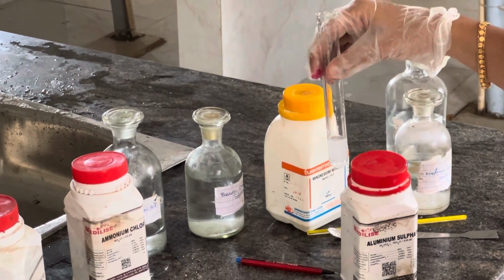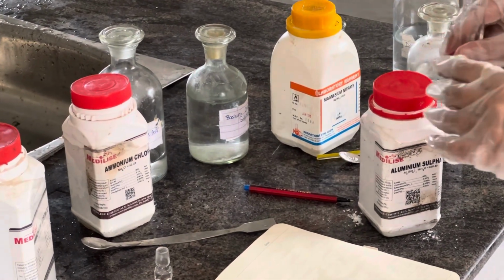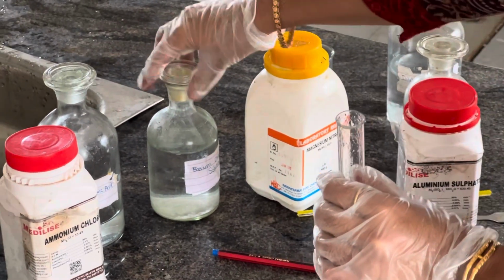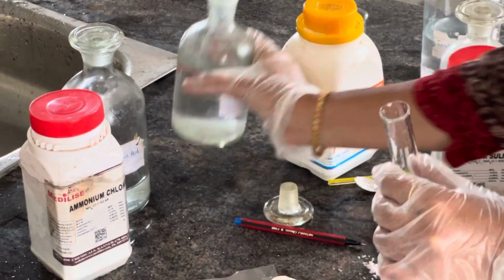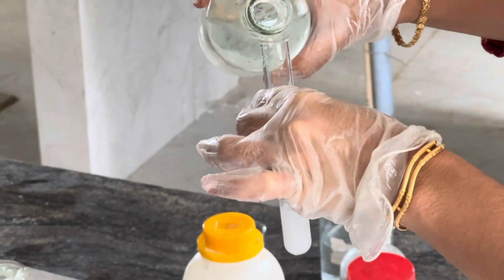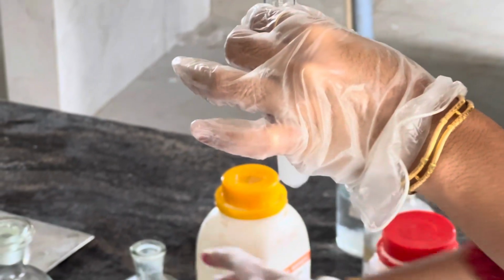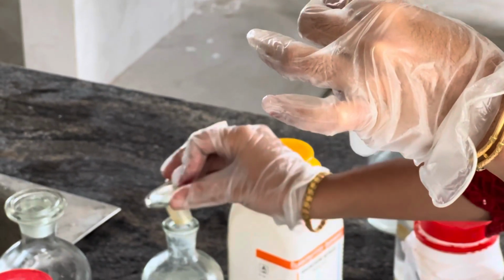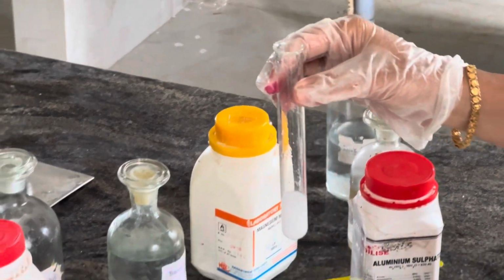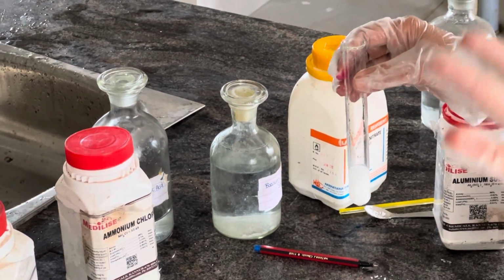So here I have the salt solution. In order to test for the presence of sulphate, I have taken the salt solution, that is, salt with a little water added to make the salt solution, which is known as the original solution. To test for sulphate, I am adding barium chloride. When you add barium chloride, if you get a white precipitate, then it infers the presence of sulphate. So sulphate may be present in this given salt.